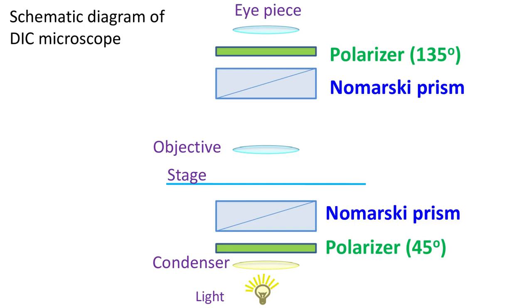The angles of the polarizer and analyzer can be changed as per the user's wish. Here we are using 45 degrees and 135 degrees just to make things simple.